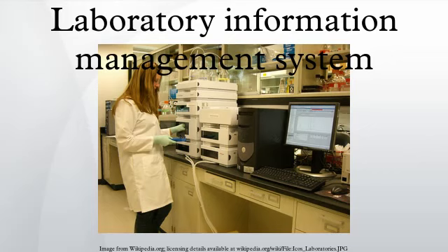Location tracking usually involves assigning the sample to a particular freezer location, often down to the granular level of shelf, rack, box, row, and column. Other event tracking such as freeze and thaw cycles that a sample undergoes in the laboratory may be required. Modern LIMS have implemented extensive configurability, as each laboratory's needs for tracking additional data points can vary widely. LIMS vendors cannot typically make assumptions about what these data tracking needs are, and therefore vendors must create LIMS that are adaptable to individual environments.